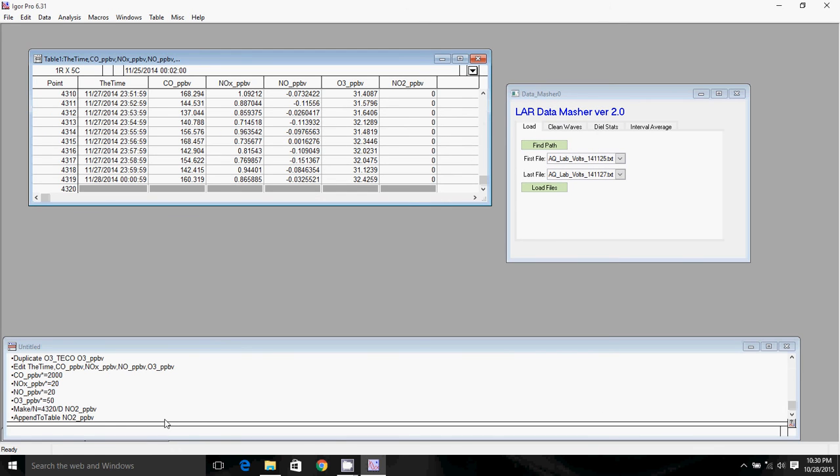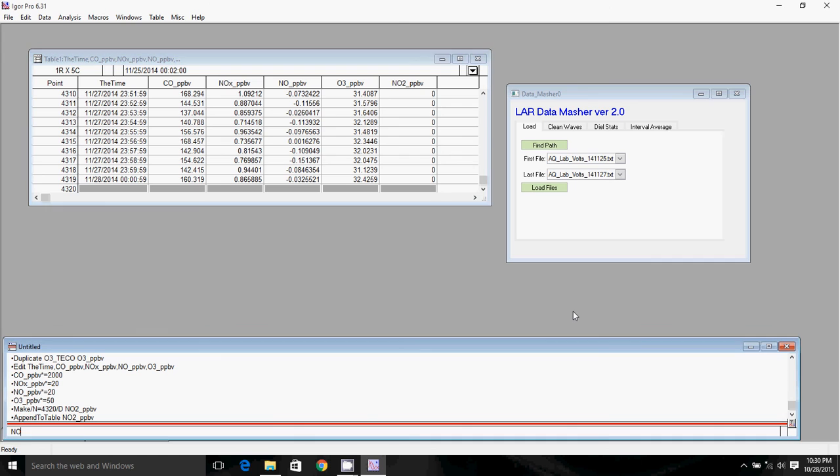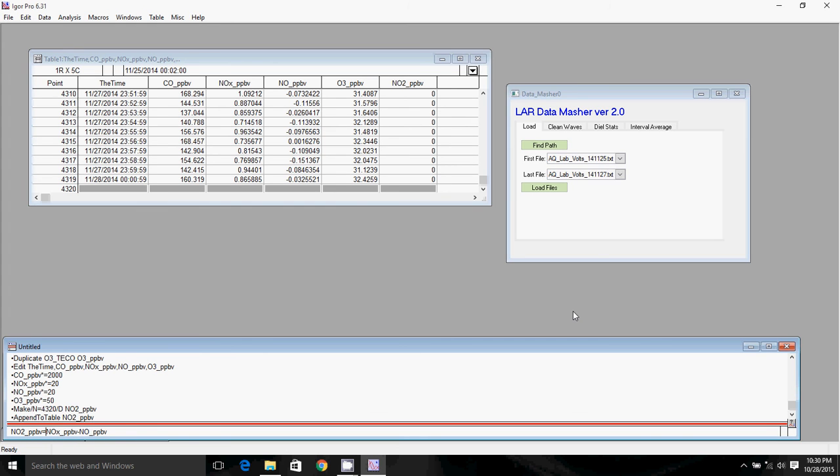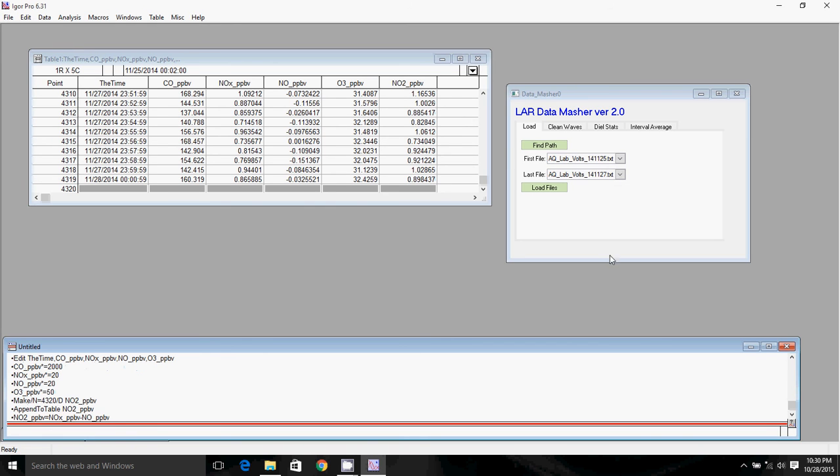So to calculate what NO2 is, we'll go NOx minus NO, and then we'll go back to the beginning. So NO2 equals NOx minus NO. And there we go.